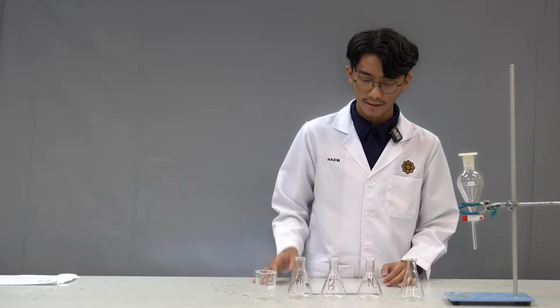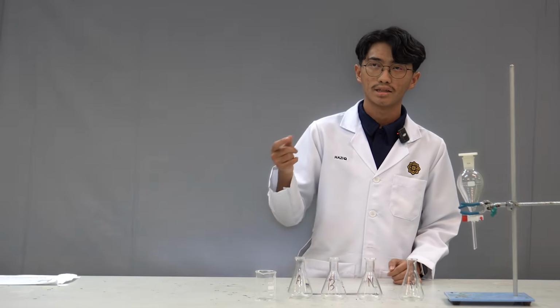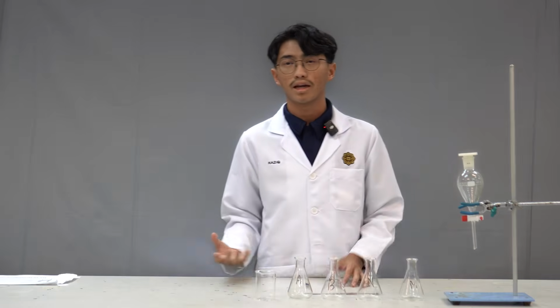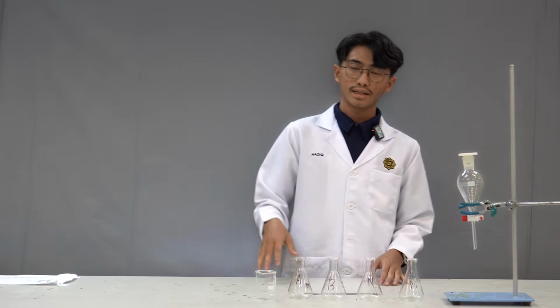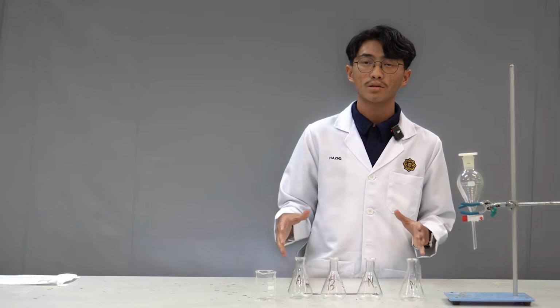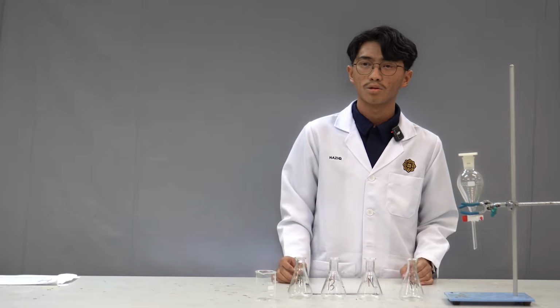Using the equipment, we will feed in a mixture of hydrocarbons that has aromatic and non-aromatic compounds, and then we will add solvent. The machine will spin continuously, and the mixture of the solution in the machine will be mixed and will react with each other.